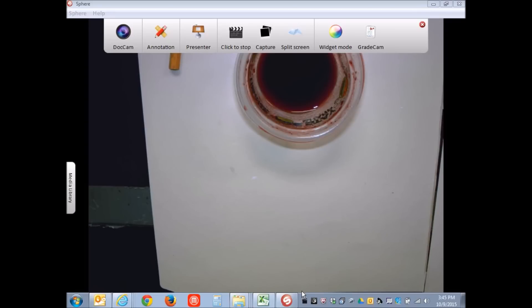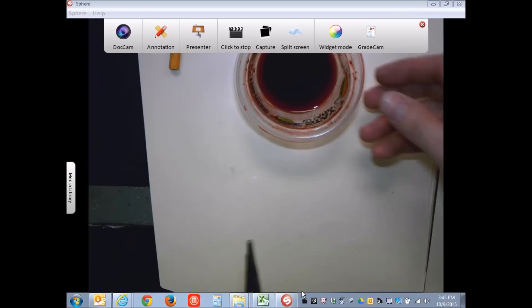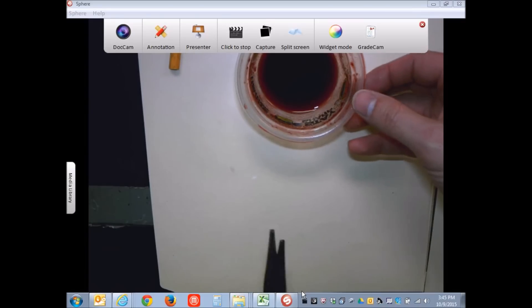There's lots of different sources for the material. I've had my cell soaking in the blackberry juice now for 30 minutes. That should be ample time for it to soak up the solution.